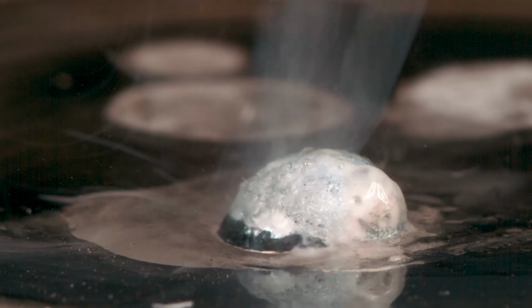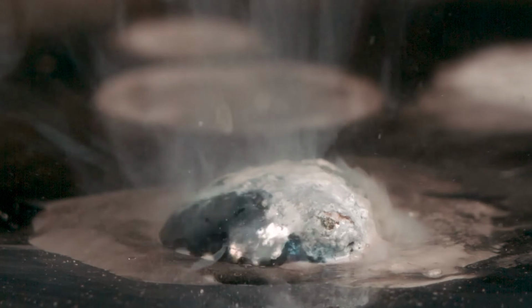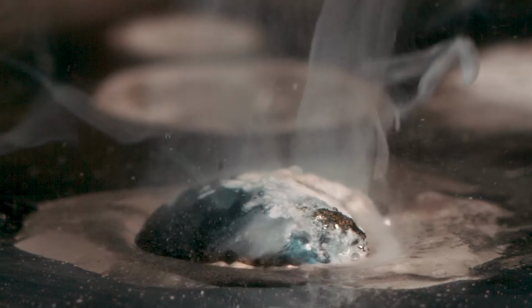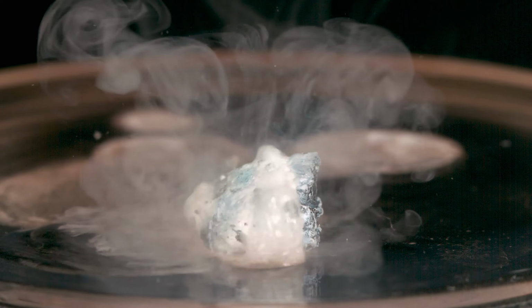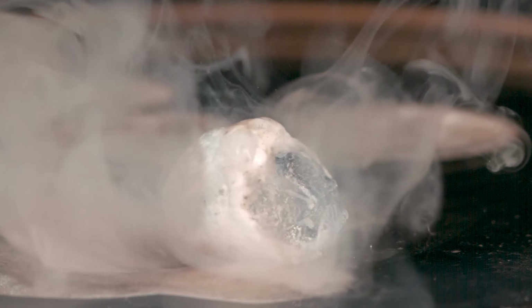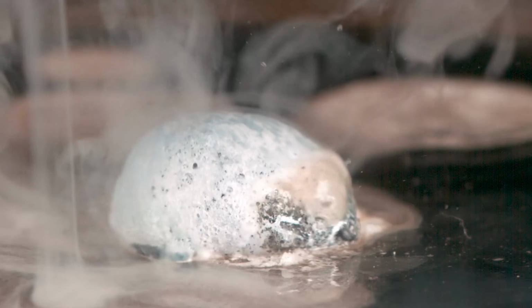And it turns into sort of like a puddle of goo, for lack of a better word. Really, it's a puddle of molten potassium very, very rapidly. And it's bubbling because it's producing hydrogen gas. Some of it may be igniting and very difficult to see, or maybe if the temperature is not hot enough, maybe it hasn't ignited and caught on fire yet. Here, I want you to pay special attention to how fast it begins to react, and we'll see that it's even faster than in the case of sodium. And also how fast it goes from a solid to a liquid molten state, again, much faster than in the case of sodium. It basically goes from nothing at all to full-on molten reaction almost immediately.